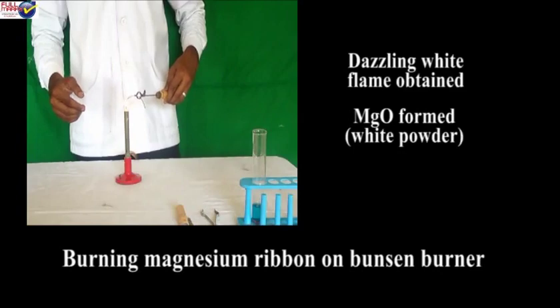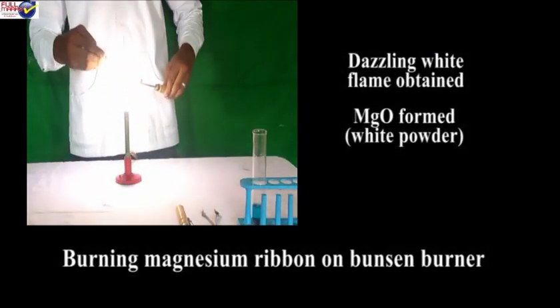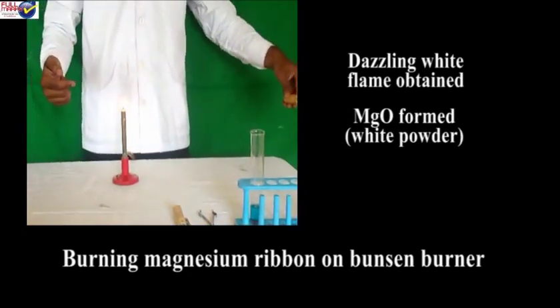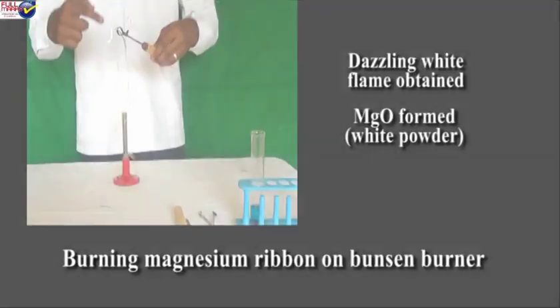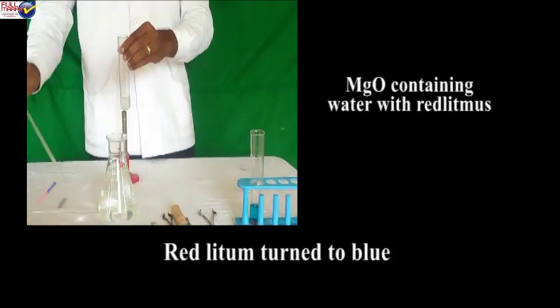2. Hold a small piece of magnesium ribbon and burn it on a Bunsen burner. It burns with a dazzling white flame and forms a white powdery mass of magnesium oxide. Add magnesium oxide to a test tube containing water and test it with litmus paper. Red litmus turns blue. Magnesium hydroxide is basic in nature.